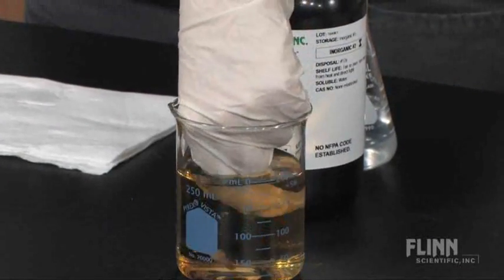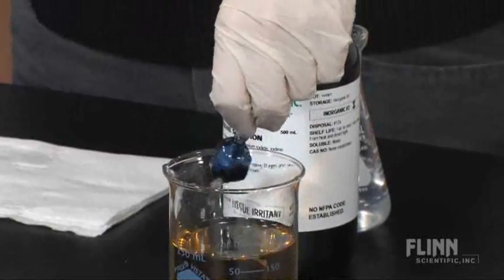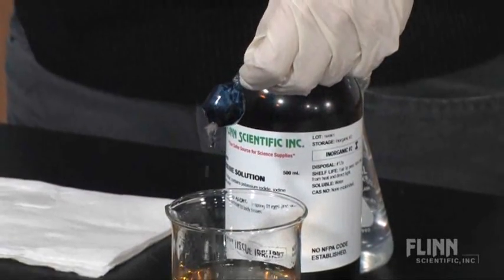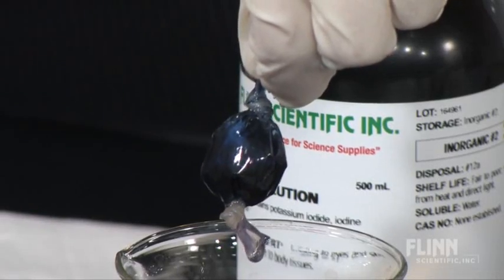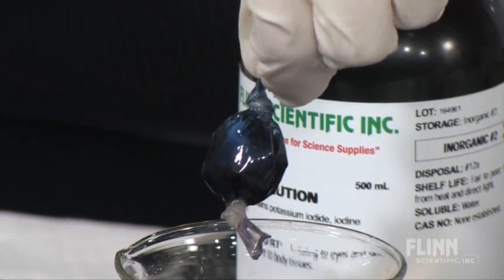However, the solution in the model cell is now a bluish black. Since it initially contained a starch solution, the presence of color tells us that iodine was able to diffuse inside of the cell.